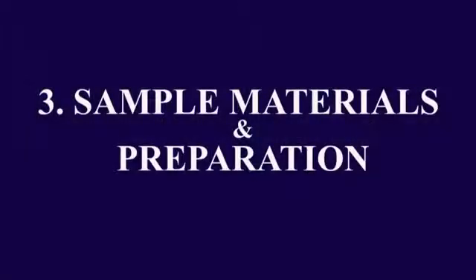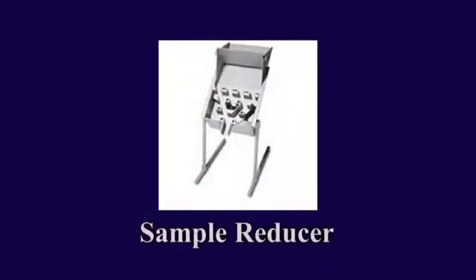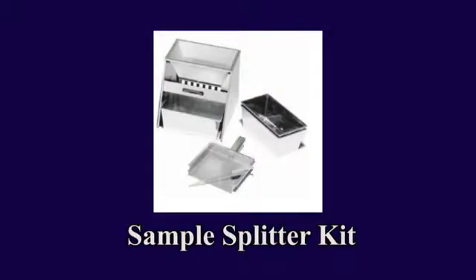Sample materials and preparation. Creating a representative material sample is critical. There are various devices available to extract a sample from bulk materials and, if necessary, reduce the product to an optimal mass for size analysis. Generally, the sample mass is determined by the product specifications.